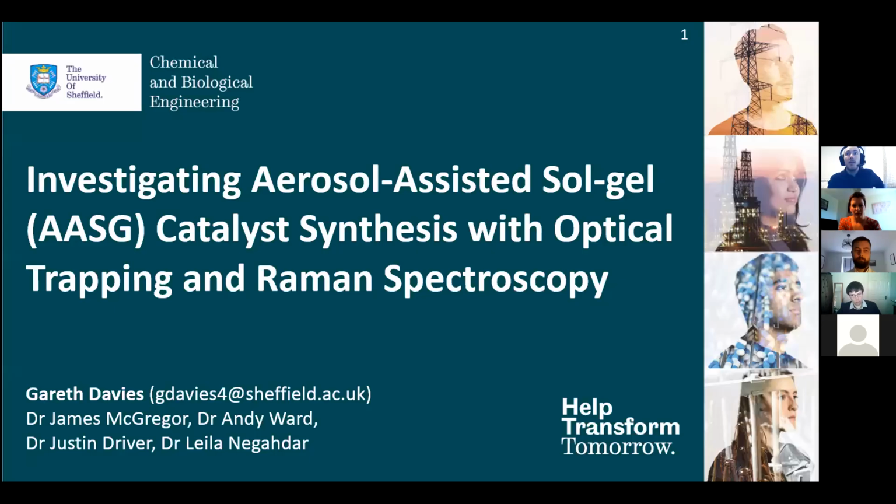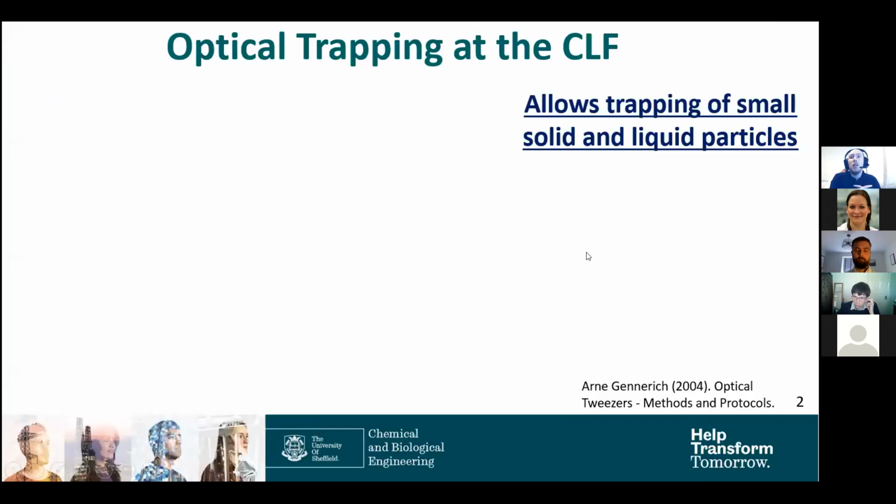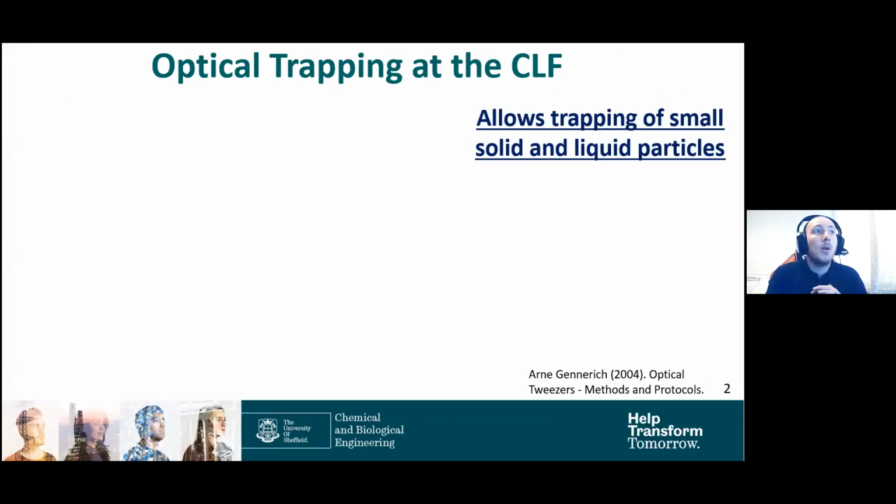The central laser facility in Harwell, as part of a small team. There we go. So at the central laser facility, I worked with Dr. Andy Ward, who is an experienced user of a technique called optical trapping, which is also known as optical tweezers. This technique allows you to trap small solid and liquid particles.